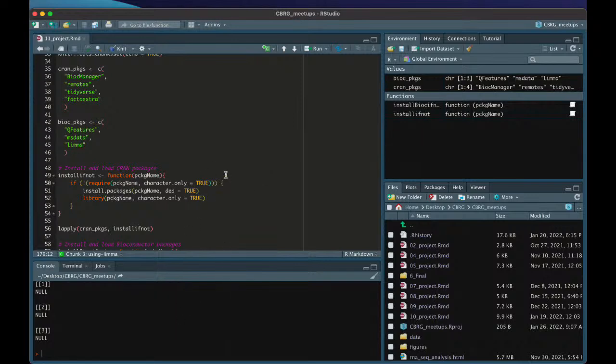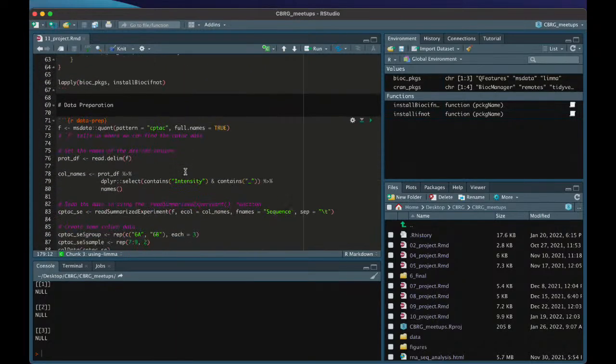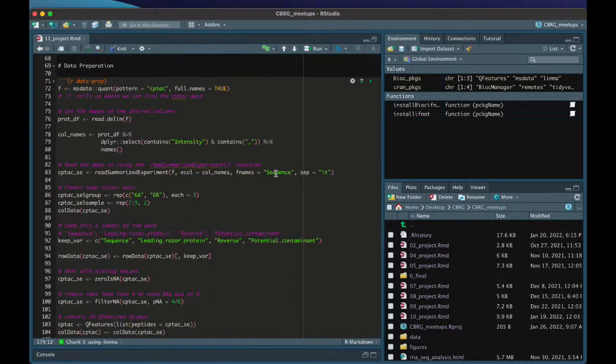If these packages are new to your machine, your console will also likely ask you to do something. Typically that means it's going to ask you if you want to install something else or update something else. In that case, definitely just say either yes, if that's one of the choices, or A, if that's one of the choices. All right, so now that I have all of these packages installed and loaded, I can go ahead and take a look at the data for today's session.